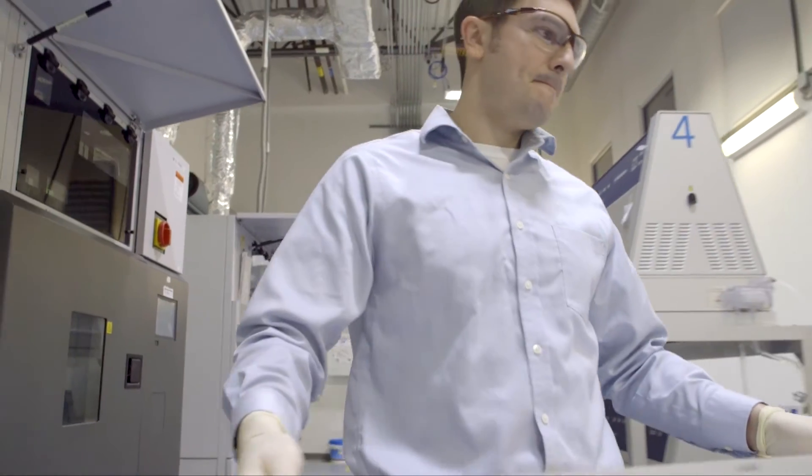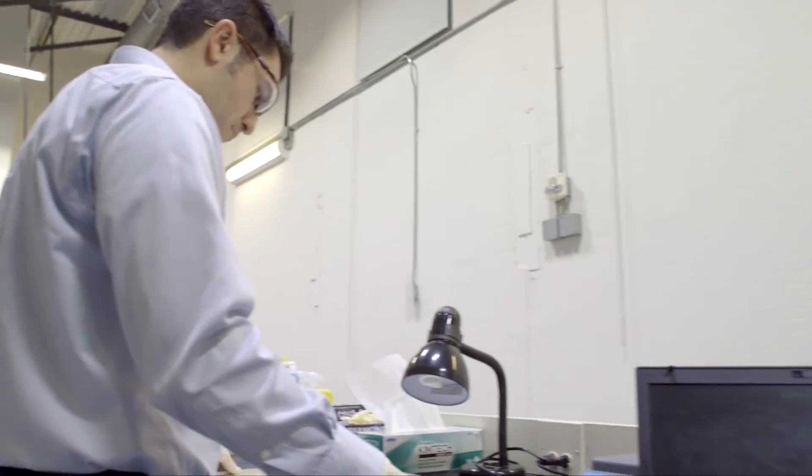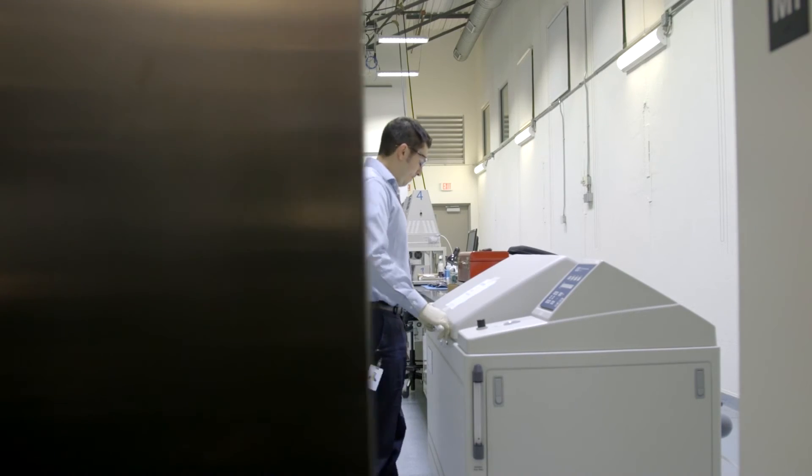I encourage our customers to reach out to their sales contact or field tech representative. They will then make contact with me, and we will set up the appropriate test in a timely fashion.